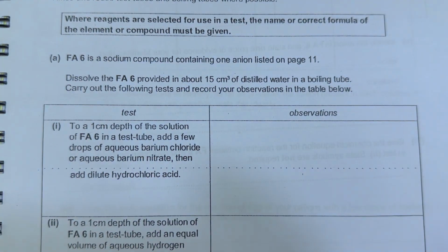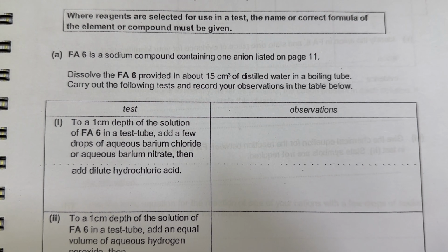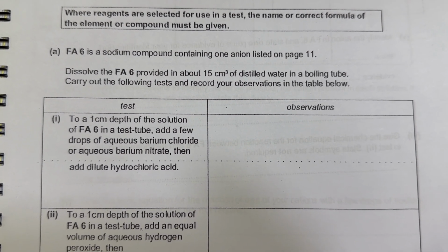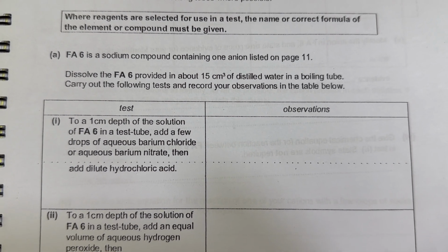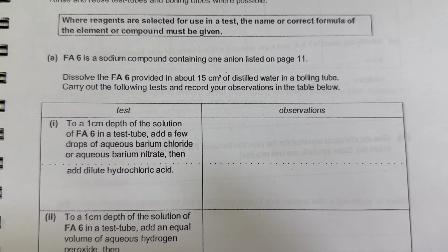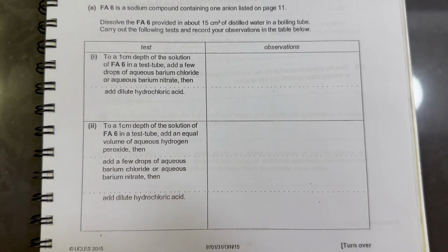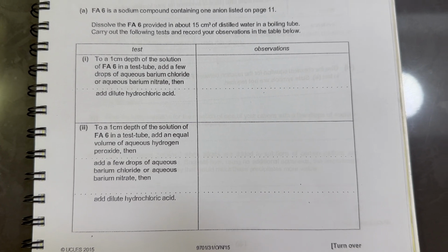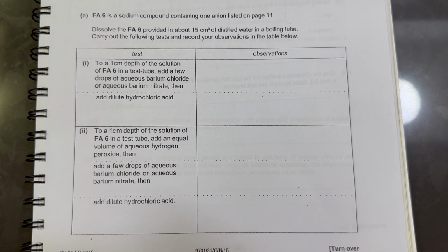Fa6 is a sodium compound containing one anion listed on page 11. Dissolve Fa6 provided in about 15 cm³ of distilled water in a boiling tube. Carry out the following tests and record your observations in the table. Now, here we have two tests to perform. So let's prepare this solution first: Fa6 in 15 cm³ distilled water in a boiling tube.